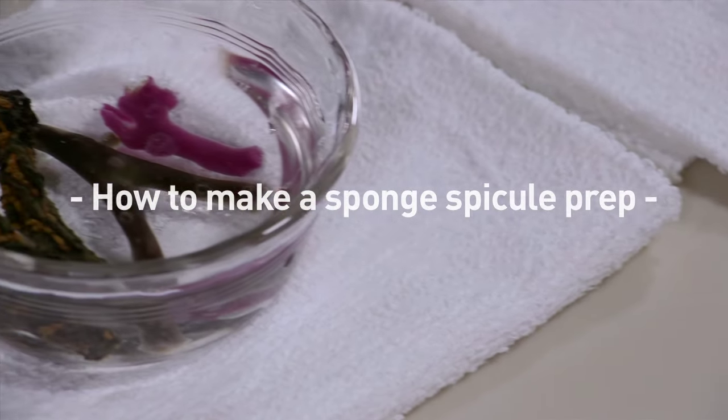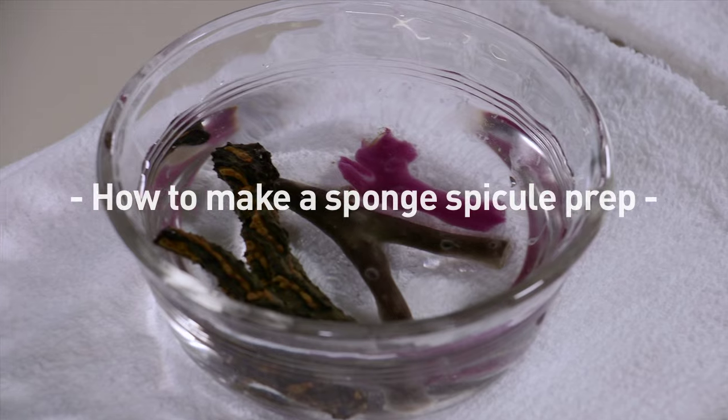In this video I'll show you how to make a sponge spicule prep using bleach. We're going to cut a small piece of sponge tissue, dissolve it in household bleach, then rinse it and look at it under the microscope.